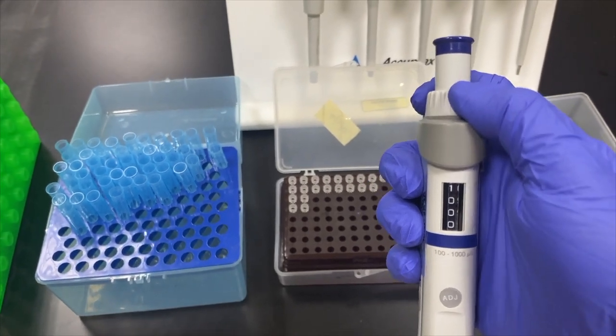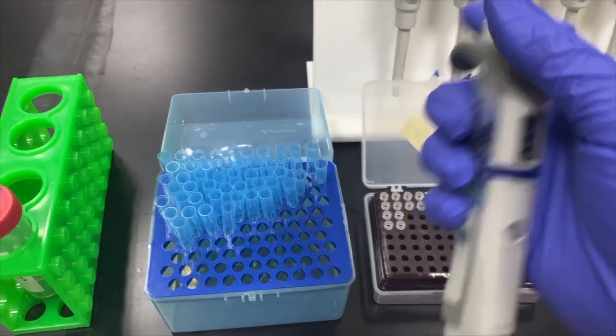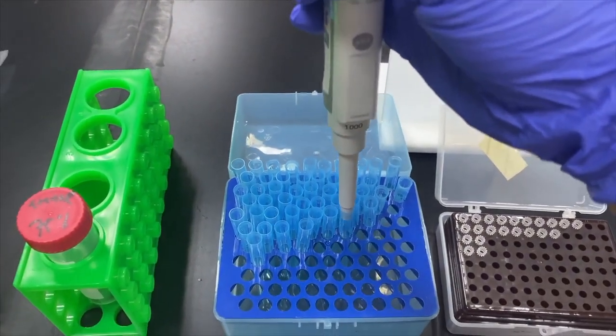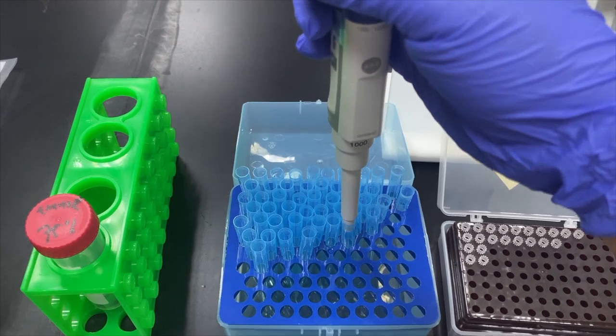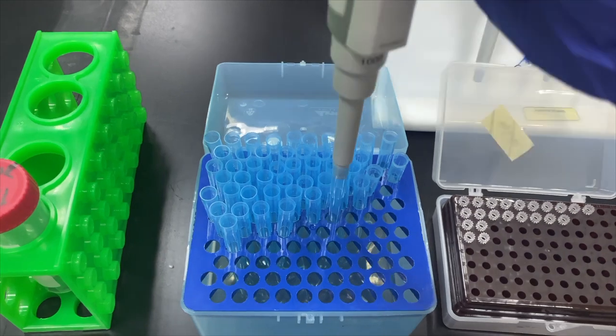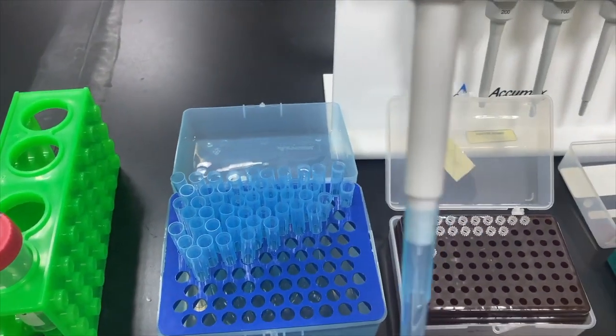So, if you want to have 1000 microliter, this already set to 1000. And then you just put the edge of the micropipette into the proximal part of the tips. You just press it so it will not loose.